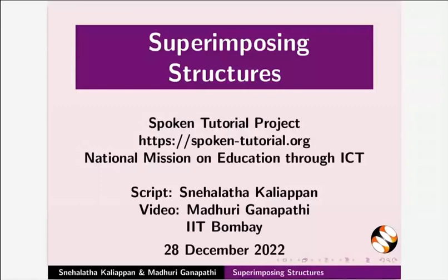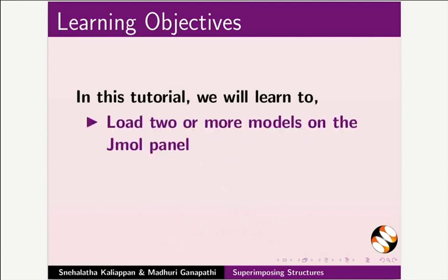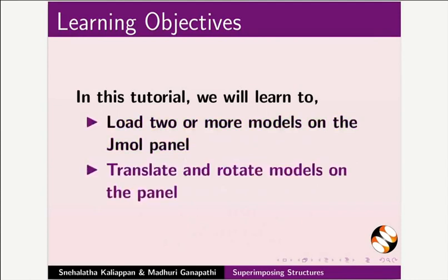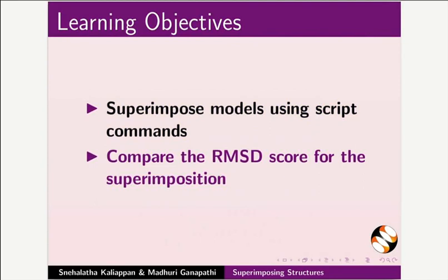Welcome to this tutorial on superimposing structures using Jmol. In this tutorial, we will learn to load two or more models on the Jmol panel, translate and rotate models on the panel, superimpose models using script commands, and compare the RMSD score for the superimposition.